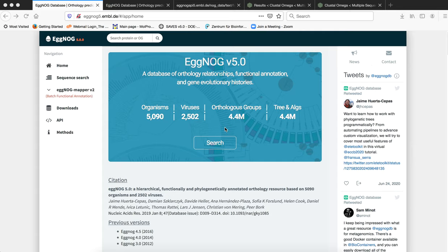We can search eggNOG using a single sequence or we can search eggNOG using more than one protein sequences as well.